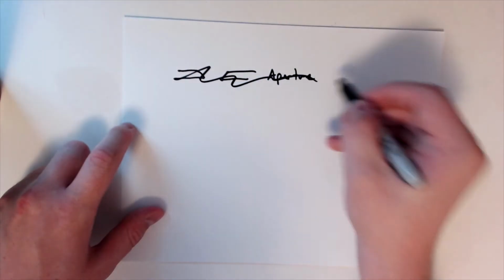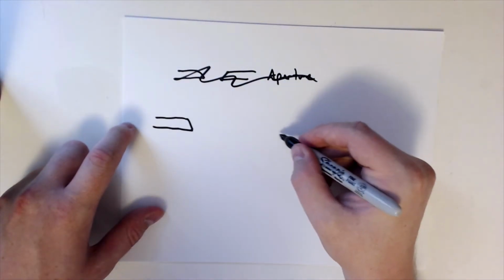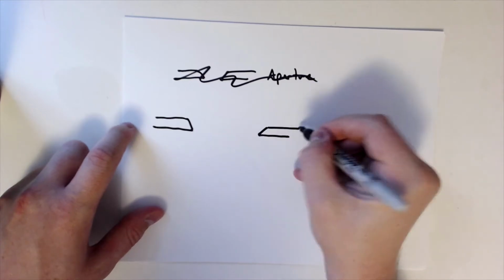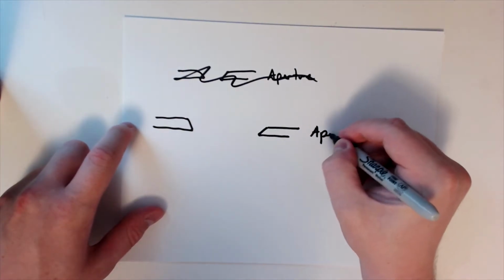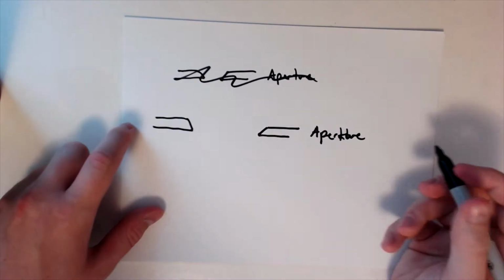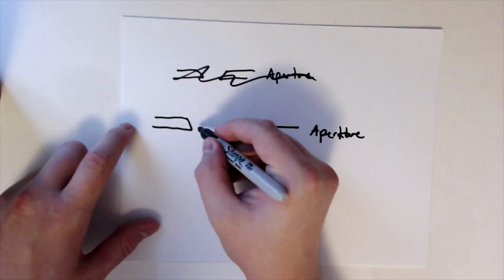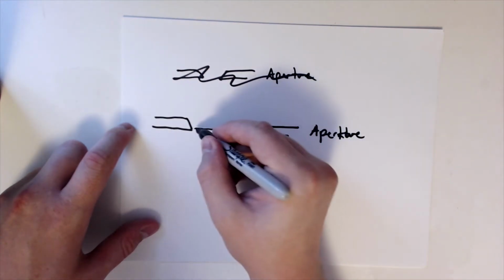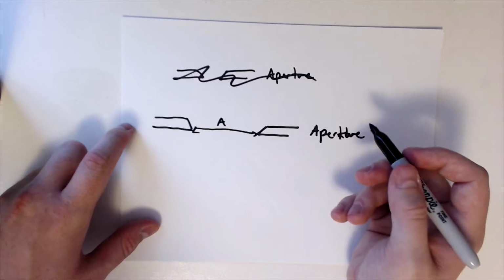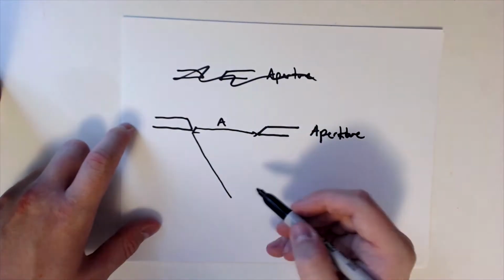Actually, let me draw a bigger aperture just for ease of this drawing. All right, this is our aperture, and this is where light's coming off. We're going to call this A to start with, the opening. And we're going to have light come out.